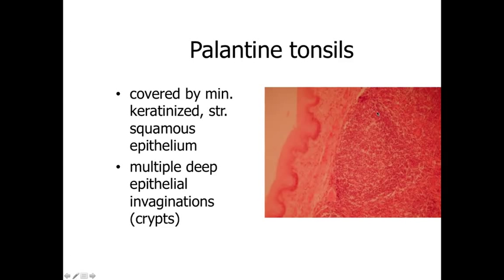The final structures we'll look at are tonsils. We have a palatine tonsil here, with a lymph nodule — a circular aggregate of lymphocytes, lots of small basophilic cells packed together. We know this is a tonsil because it's located in the connective tissue underneath a minimally keratinized stratified squamous epithelium, indicating a moist cavity subject to abrasion. When we see a lymph nodule underneath simple columnar epithelium, we know we're looking at a lymph nodule within a Peyer's patch within the intestines.